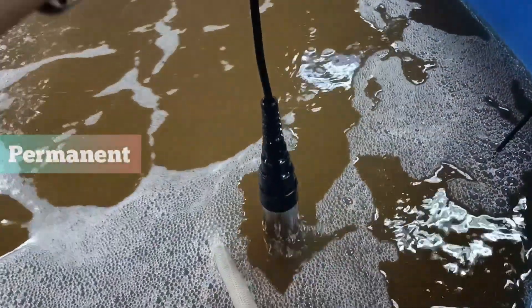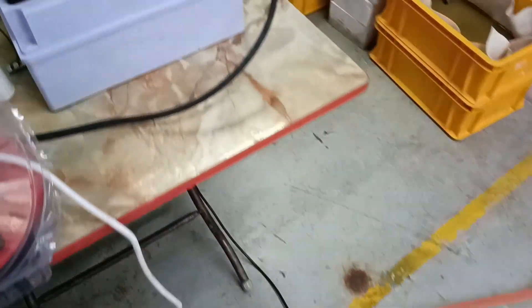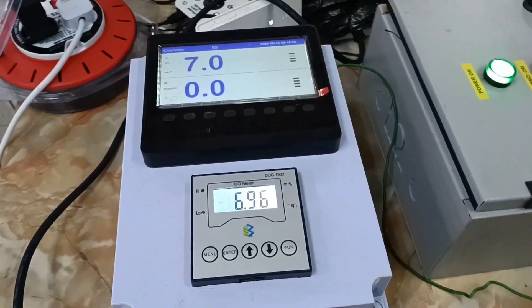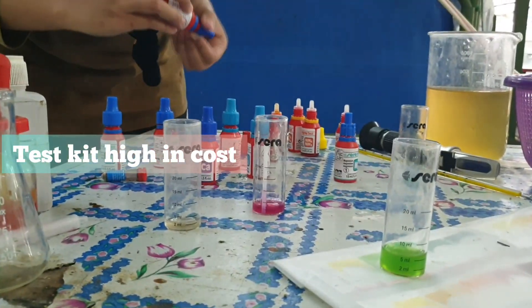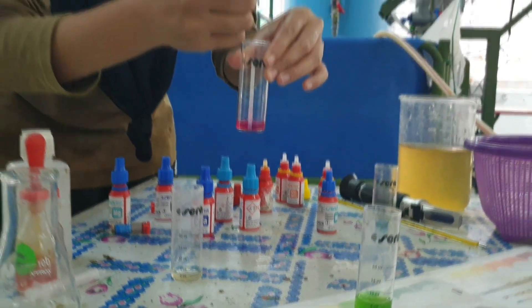We can permanently install this type of DO meter in the tank, as compared to the portable one. Initially, we used a test kit to determine the DO level in our bioflux system. However, because it is expensive and we need to keep buying test kits, after a while we switched to another option — a DO meter.